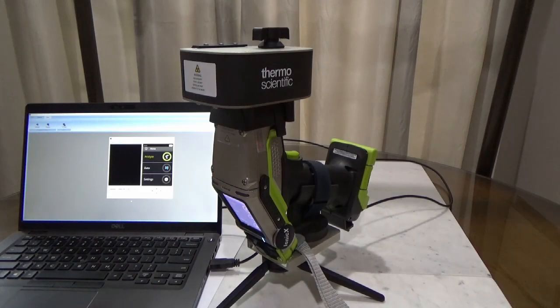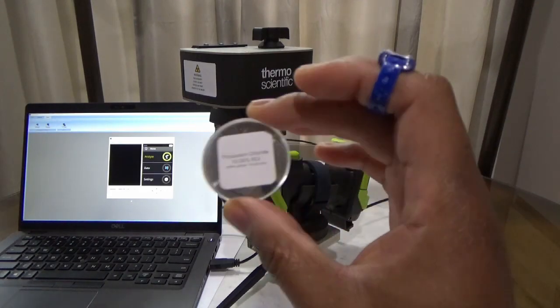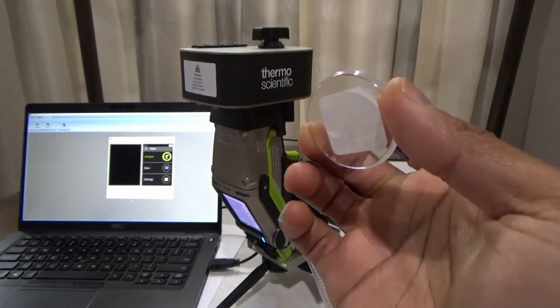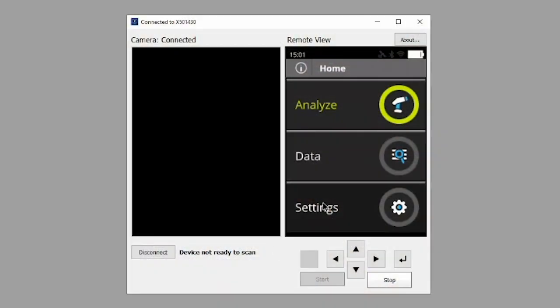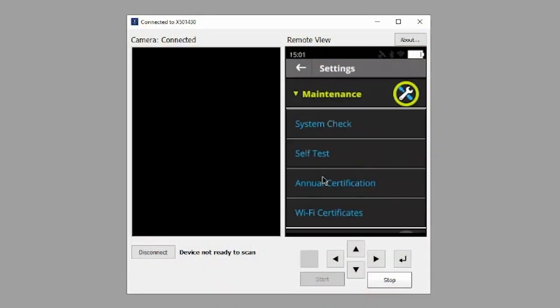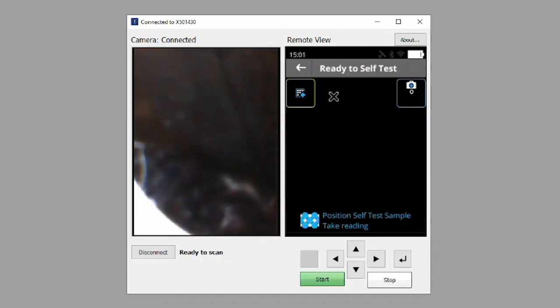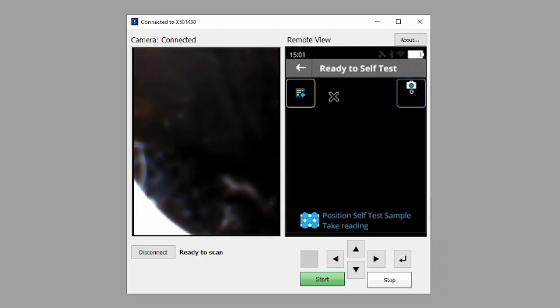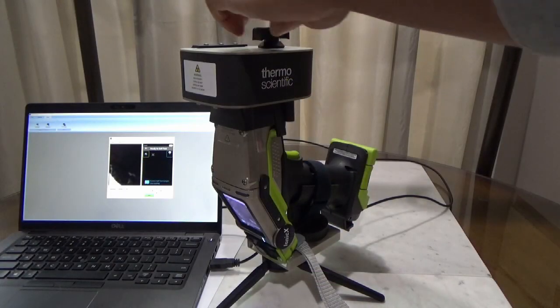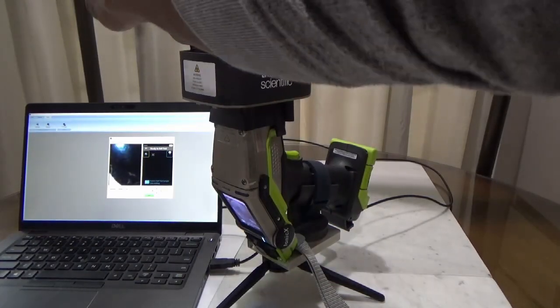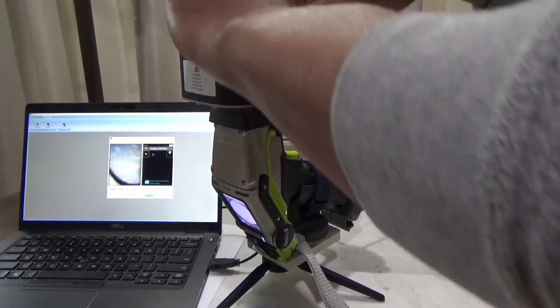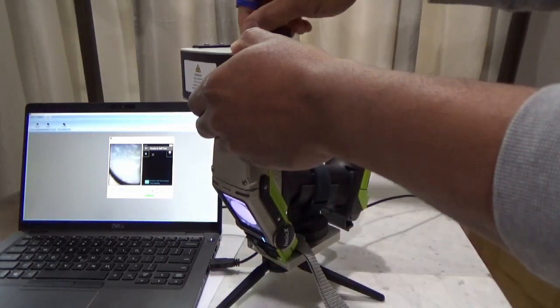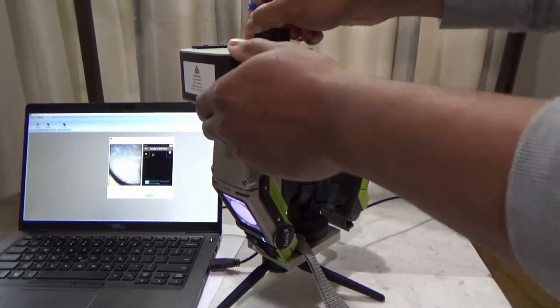First, let's run a self-test. The self-test is performed using a potassium chloride salt standard. The self-test is accessed by going to Settings, Maintenance, Self-Test. Click again on Run Self-Test Now to enter the testing screen. Now we position the self-test sample to take a reading. Open the top of the sample compartment and set the salt standard in place. Be sure to securely close and lock the lid to ensure the safety interlock is engaged.